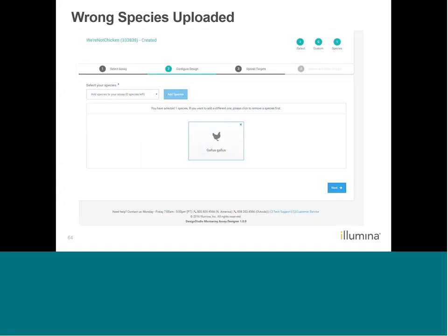Let's look at a few of the problems when we're actually creating our design. So what happens if we upload the wrong species? So in this case, we want to design a chicken array.